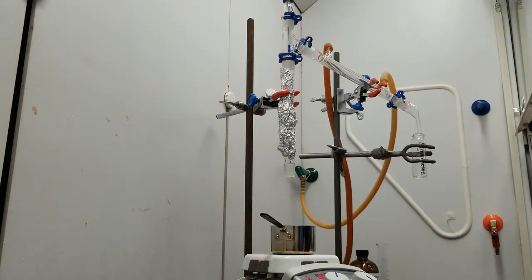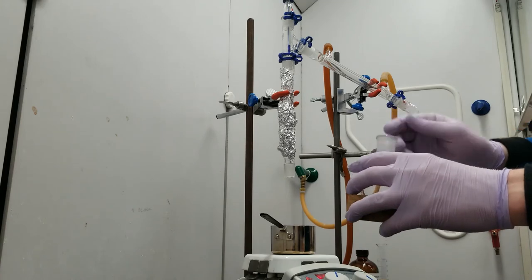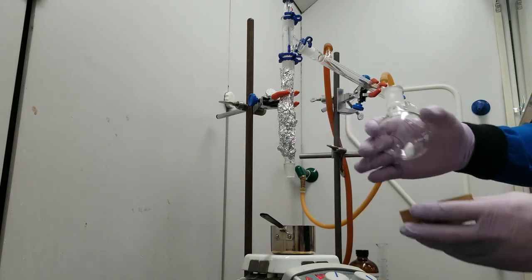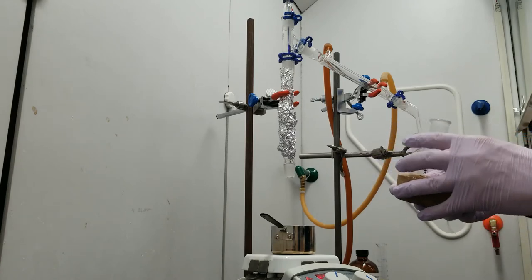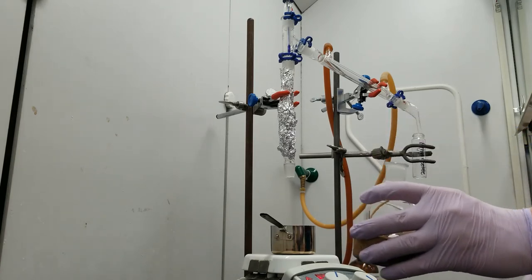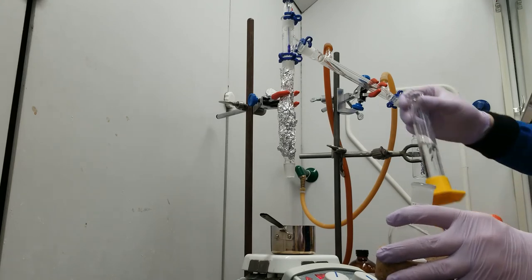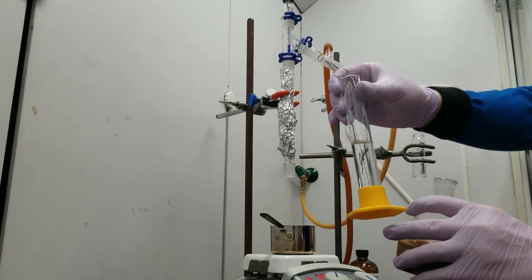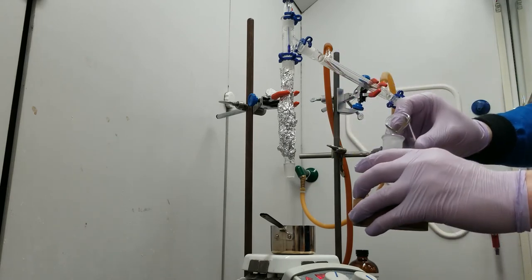That I'm going to run the distillation in. I've got a boiling chip in it. I've got a stir bar in it, and that's all just going to agitate the solvent to encourage tiny bubble formation. Here is my mixture of ethyl acetate and toluene. So that's going to go right in.